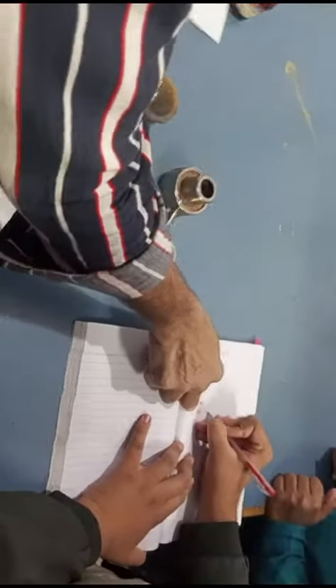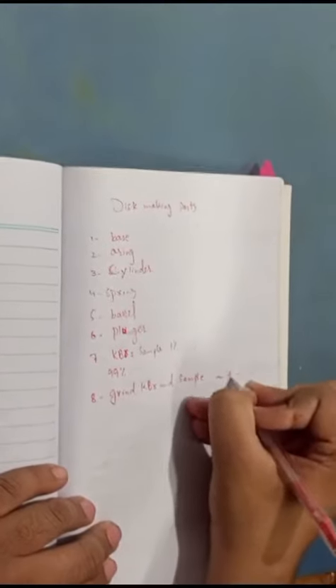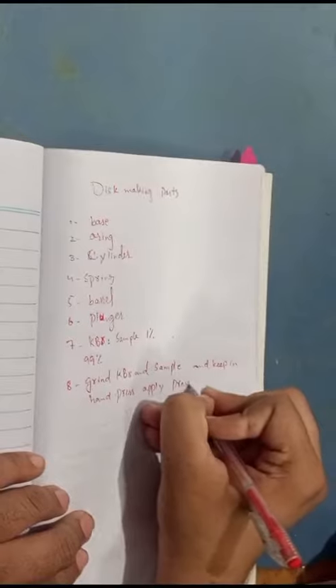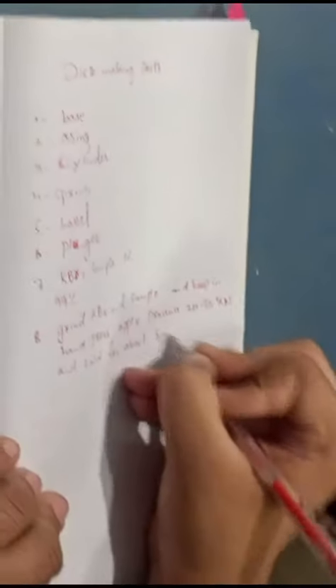This is a KBr. Apply 20 to 30 kilonewton and hold for about 3 to 5 minutes.